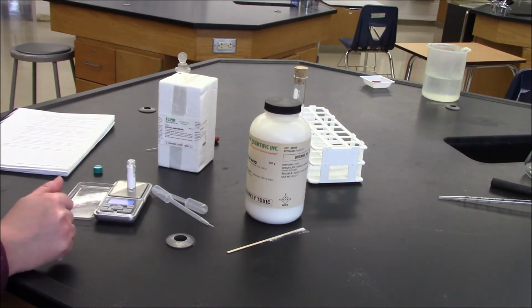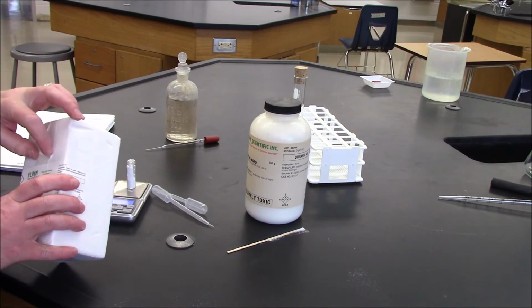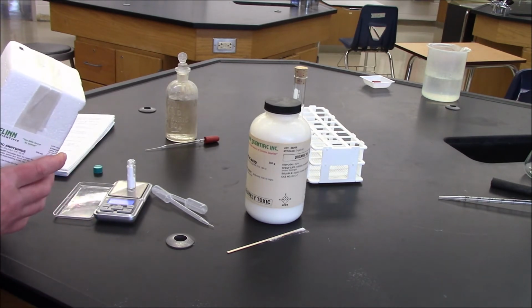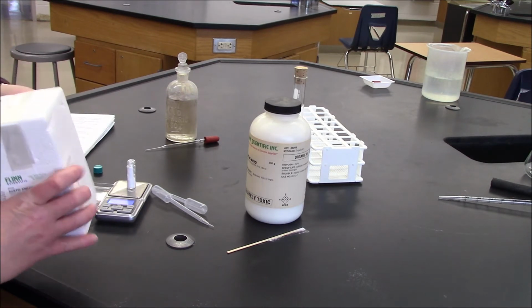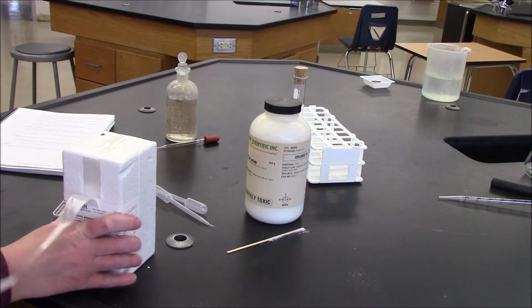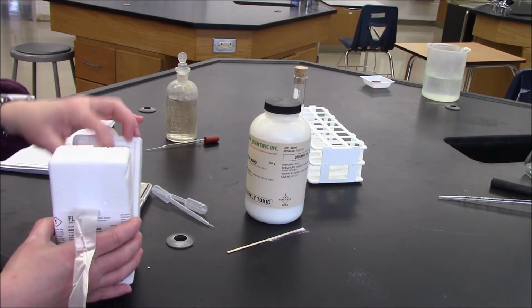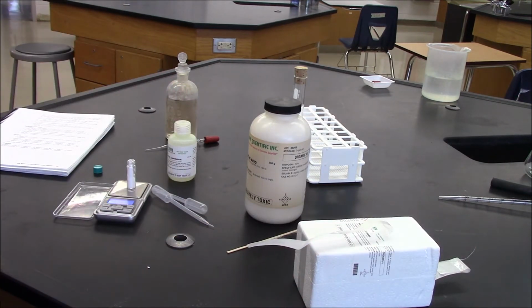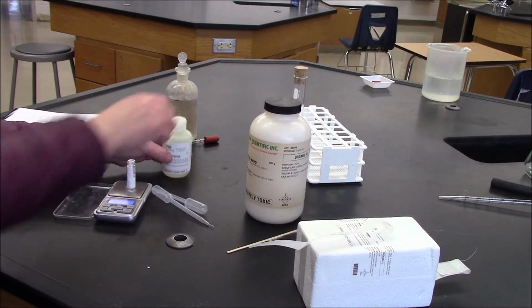Next, what I'm going to add is 1 milliliter of my acetic anhydride. It has a density of 1.08 grams per mil, so I'm going to be adding 1.08 grams of acetic anhydride to my reaction vial. I'll tare this.